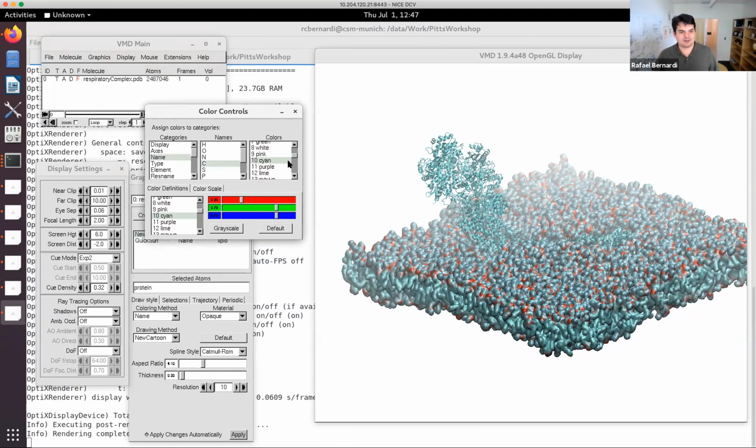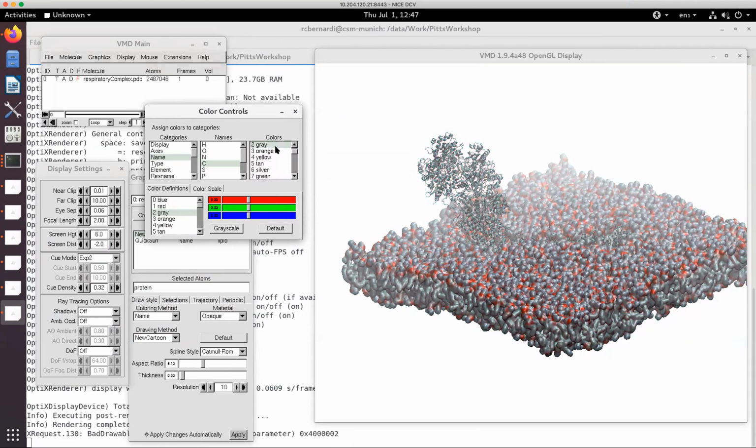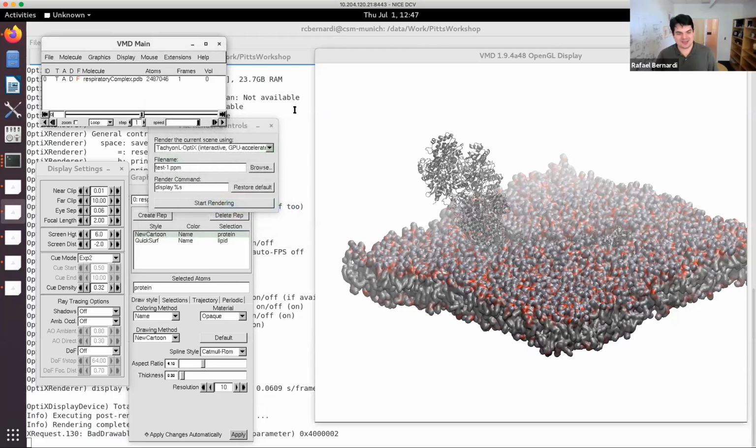Instead of being cyan, you can change it to, I don't know, you can change... So I have to interrupt you already. You're using an ancient version of the code. I have a totally revised new color menu. Ah, you're showing the old one. I know you have that, John, but I'm going to get to my point. Okay. Yeah. So you can come here and change that.